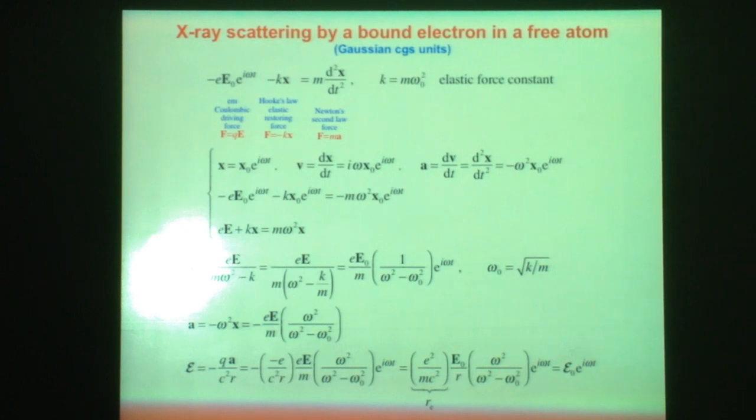If it gets closer to the nucleus, be held more tight, and so on. So there's a spring constant to worry about, kx, where x is the position of the electron. And then these two forces, the Hooke's law force, the Coulombic force, they add together, they're of the same sign, and they must balance the Newton force, Ma.